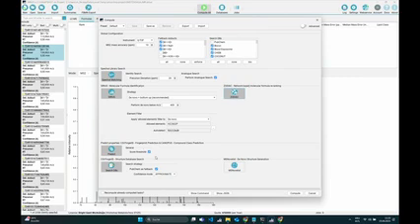And the last thing is the search in structured databases, or also, of course, in your custom databases that you imported. Here, the only thing that you might want to set is quite an interesting setting. I didn't tell you this in the beginning, but by default, PubChem is not selected. The reason is that we first try to find stuff in all these bio databases, which are selected by default, or if you toggle this bio button. If we can't find a hit, we have this new setting, which we call expensive search, PubChem as fallback.